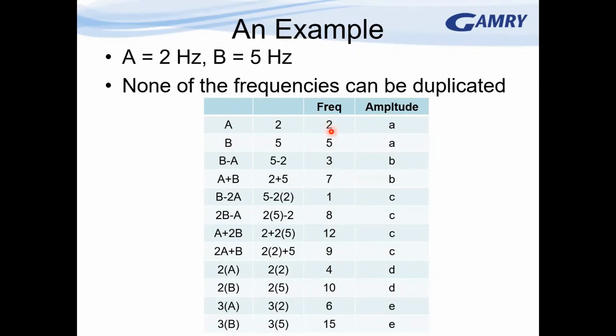In fact, we're going to get responses at these frequencies, and then we would expect the amplitude at those frequencies to be the same. And if you take note, we can also see that there are some gaps. So we don't have a frequency response at 11 hertz or 13 or 14 hertz. So that's what we should see to validate that the actual technique is working.